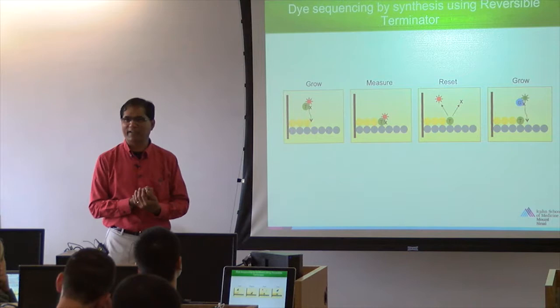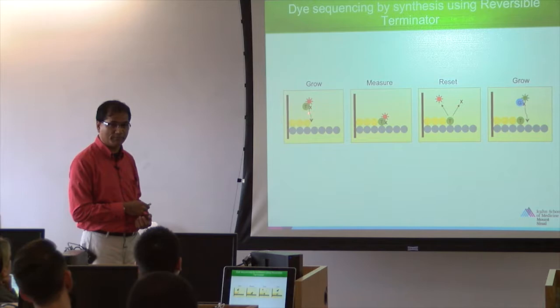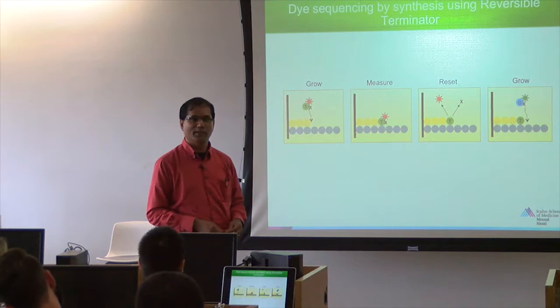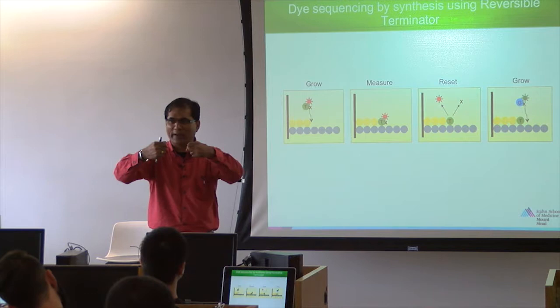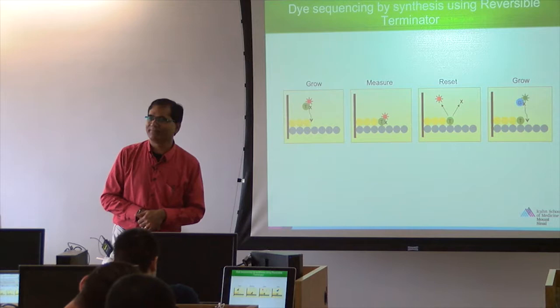The idea here was, let us do a Sanger type. Let us add a fluorophore here. Let us block this elongation. But let us not do the dideoxy type, where it is permanent. Let us add some chemical here which is reversible, like in a chip type. You know, you made protein-DNA interactions, but they're reversible at high temperature. Same thing. You made it reversible. You add this, it is blocked. Remove those blocks, and then start again. It's called reversible terminator reactions.